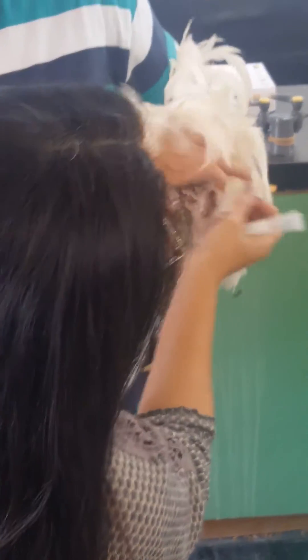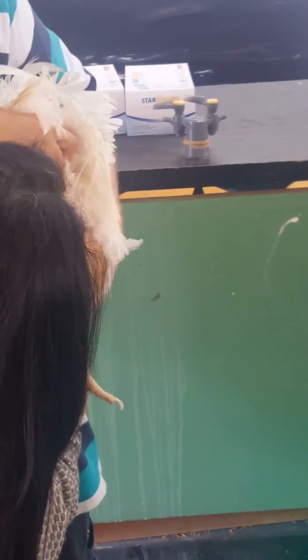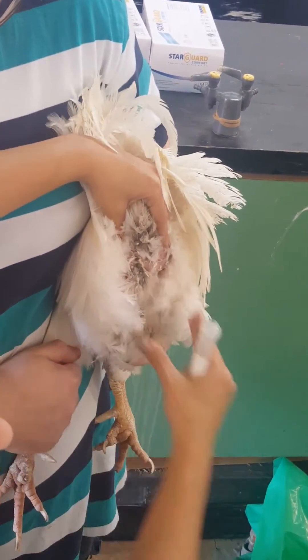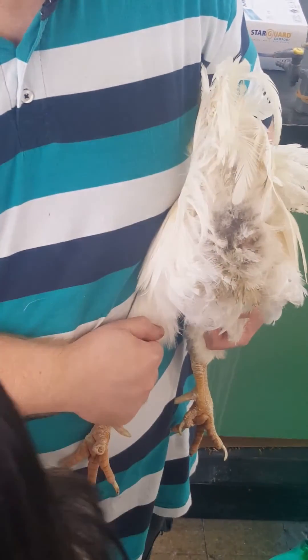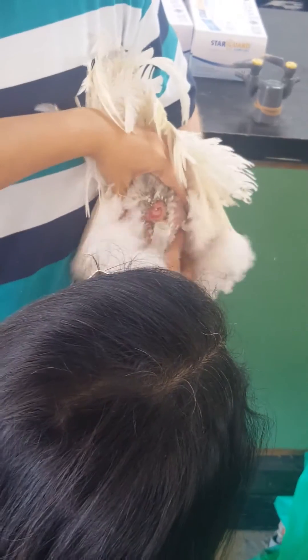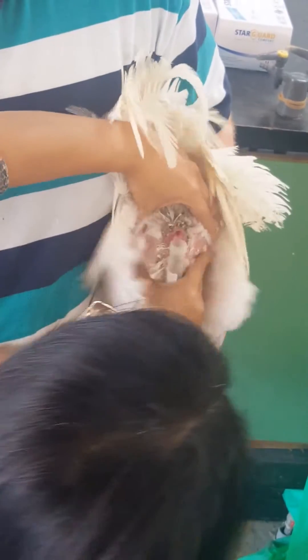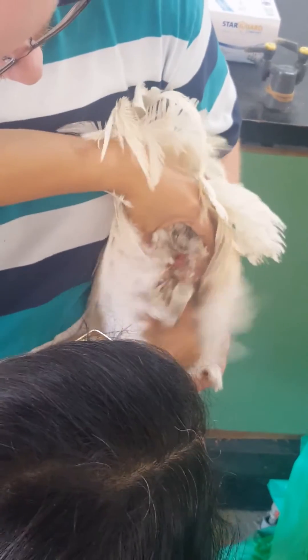As I explained, there are three openings, so it's really difficult to take only semen. I need to let them — read all the fissures and everything — and wait until I have a clear semen. So I'm cleaning and then I'm pushing it, and again I'm massaging.